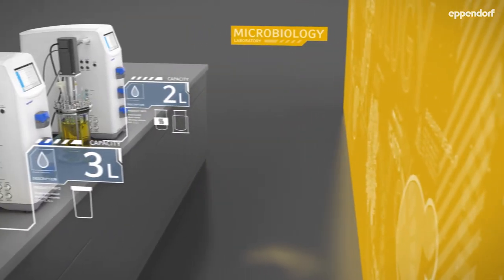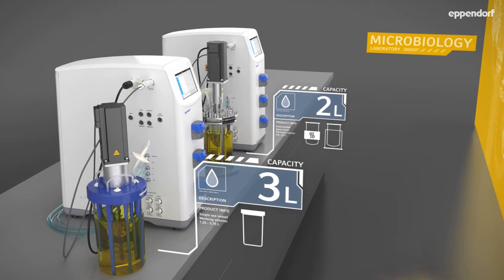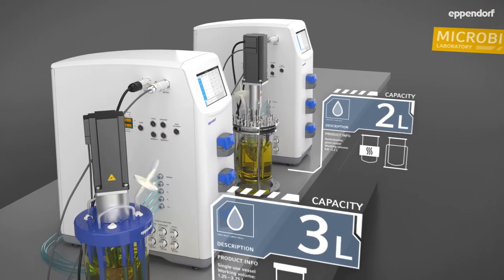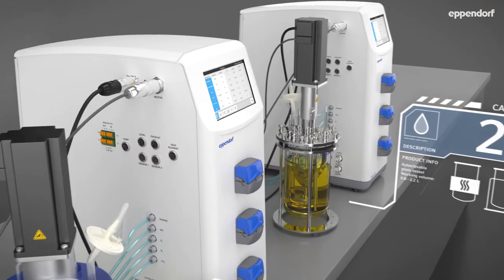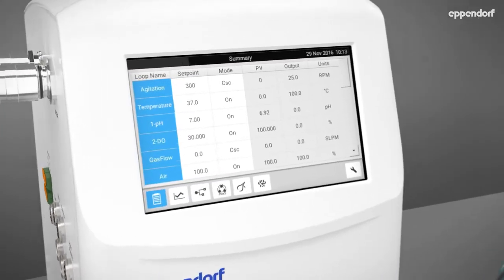The control station features an integrated touchscreen monitor and a flexible software platform for universal control of microbial and cell culture applications, ensuring critical process parameters can easily be accessed as needed.